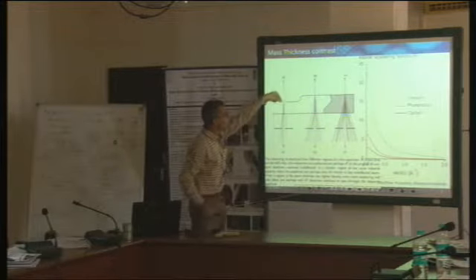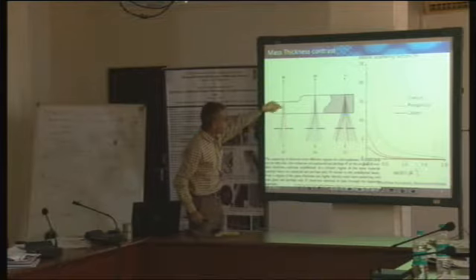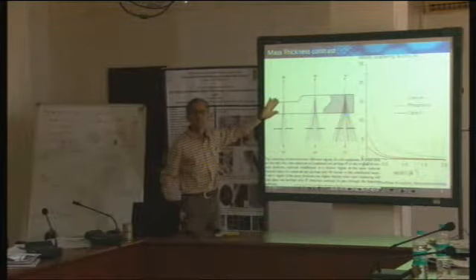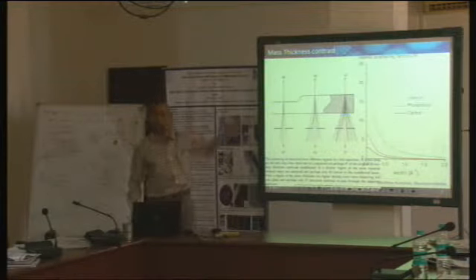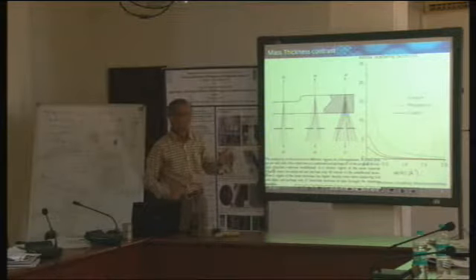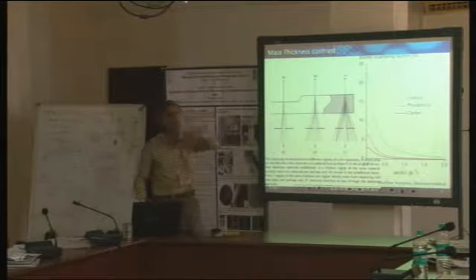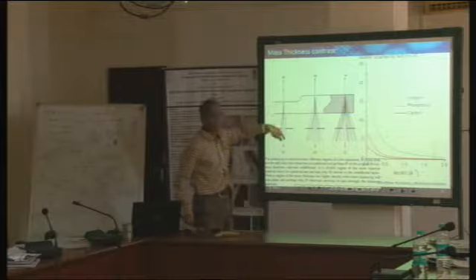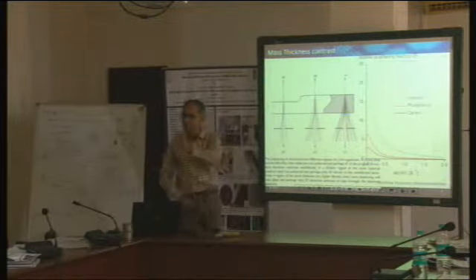Okay. So let's say the electron beam is falling here, and then there is scattering. But here the scattering is not much, correct? Because, first of all, it is thin, and secondly, it is also light. So there is not much scattering, and most of the intensity remains in the parallel beam, in the forward beam, which was our original beam. Most of the intensity doesn't get scattered; it remains there. This is common sense, correct?